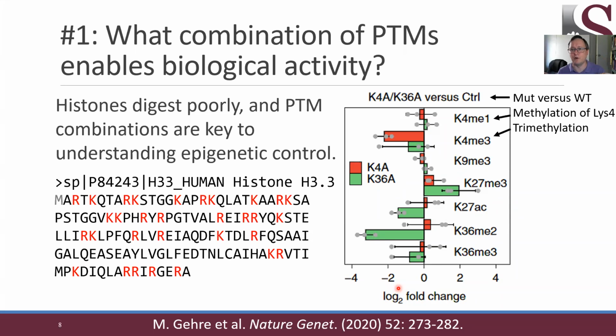If different proteoforms have been phosphorylated differently and you produce shotgun peptides from different proteoforms, you might say, well, we know that this site and this site and this site are phosphorylated, but that is a wrong claim unless you have one peptide that shows all three of these have been modified on the same sequence, right?